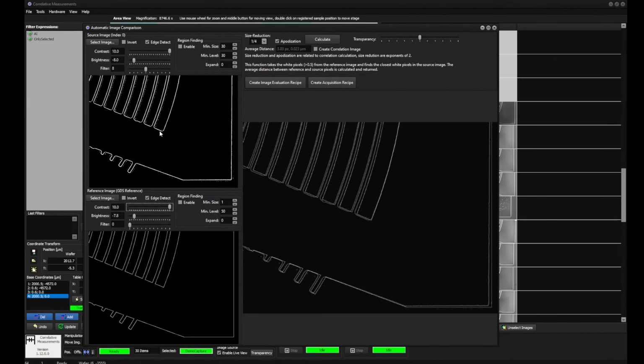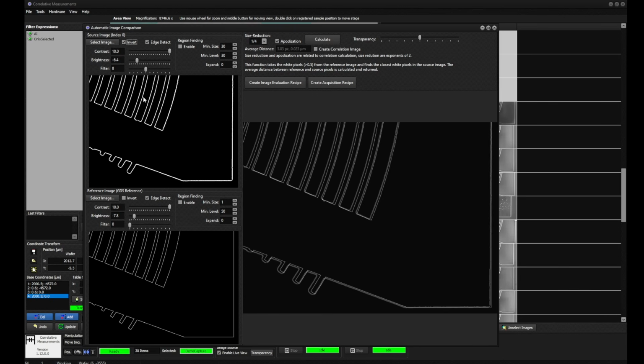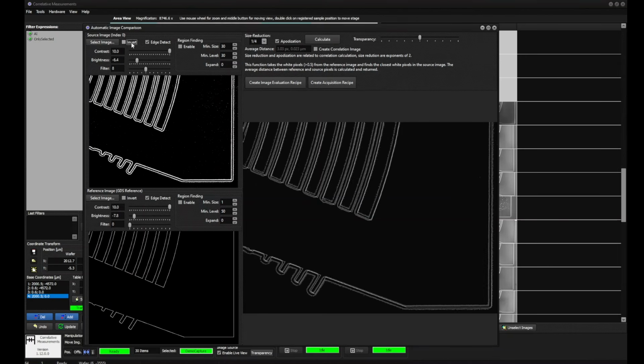Here more can happen, especially in this area. You can see there are single pixels and then we have 2 lines here and so on. We should set the inversion switch so that we get as much contrast and as little noise as possible in the background.